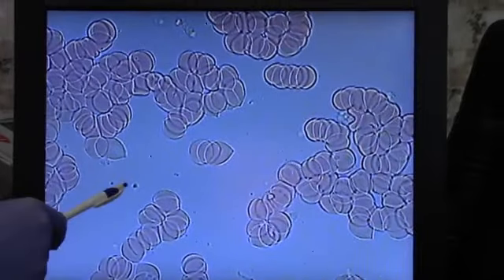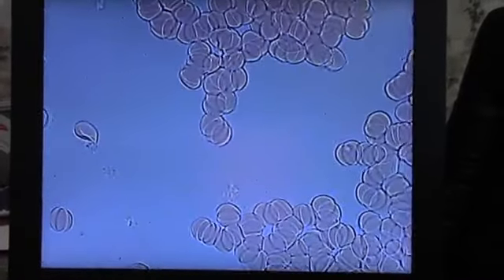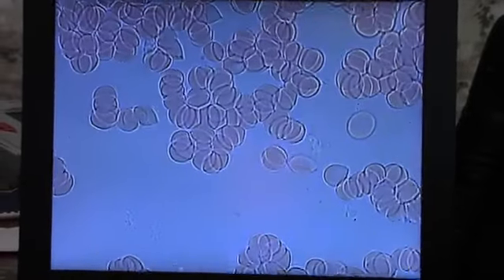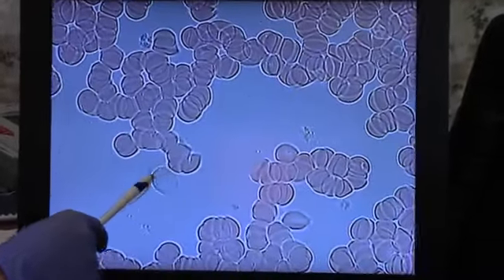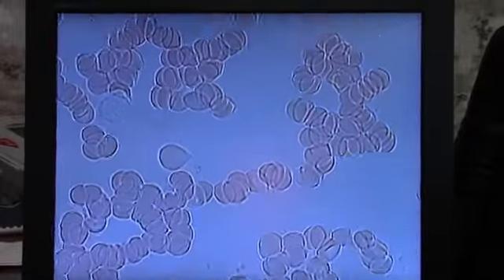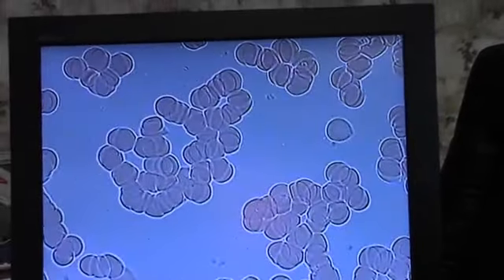Got a little bit of fat plaque in there. And white blood cells look good. You almost can't even see the shape of the cells because they're so sticky. He does have some macrocytic cells in there, and that's when they're a little bit on the larger side like that. We'll typically see that with malabsorption of B12. What would unstick them? Digestive enzymes. You need good digestive enzymes and to try to stay away from high stress proteins.